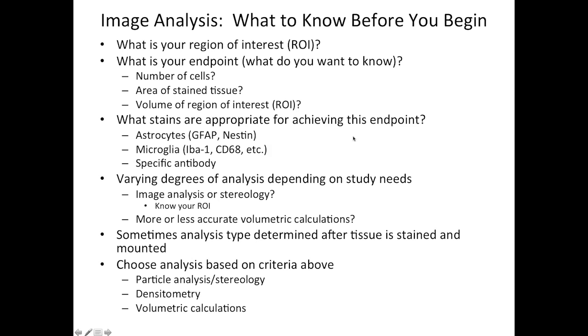In addition to this, there are varying degrees of analysis depending on what your study needs. So if you're doing a preliminary study and your analysis needs don't need to be incredibly detailed, if you're looking for large differences between groups, let's say, then maybe you're not looking to spend a whole lot of money on analysis.